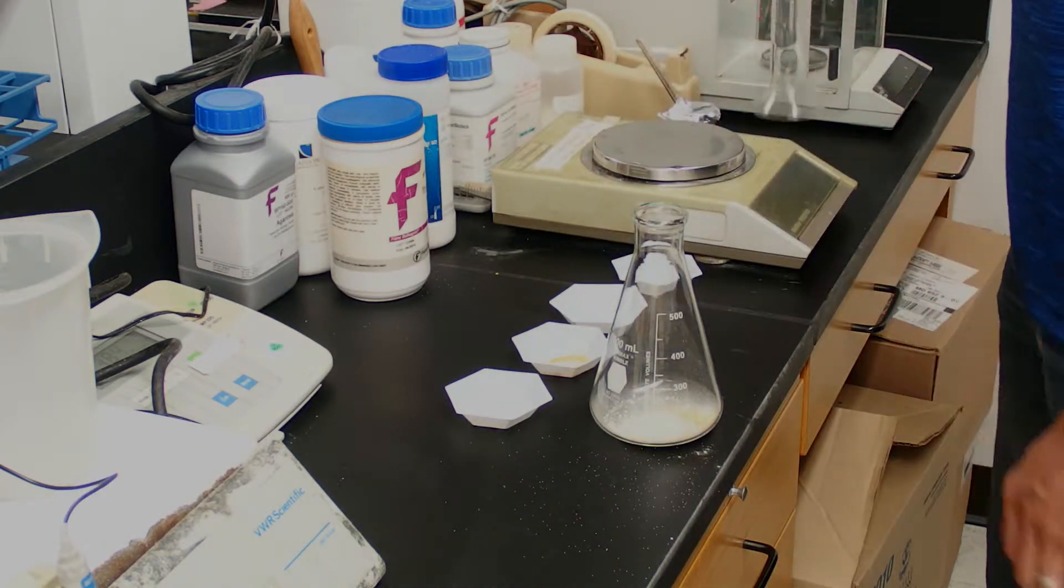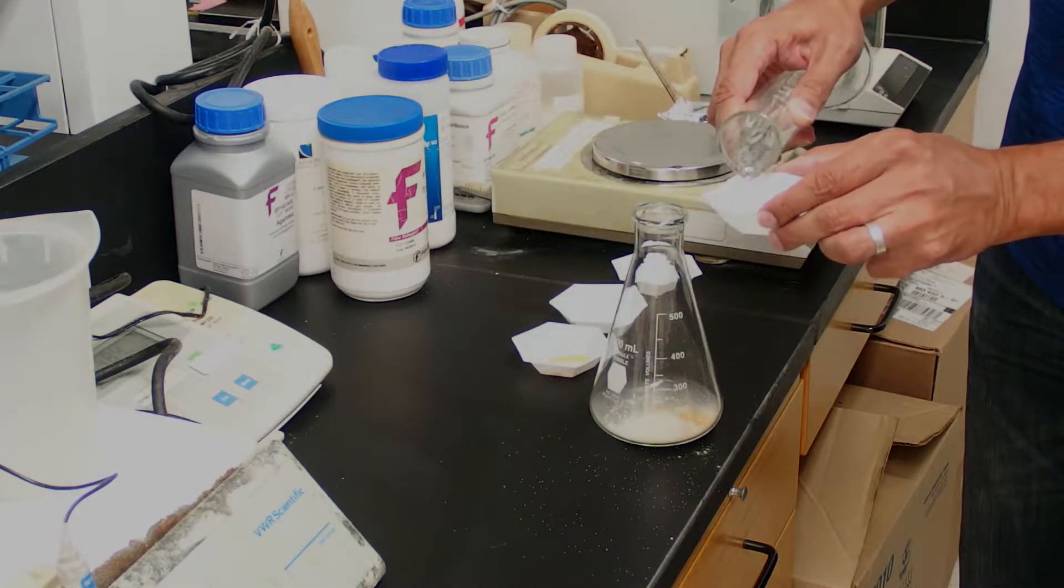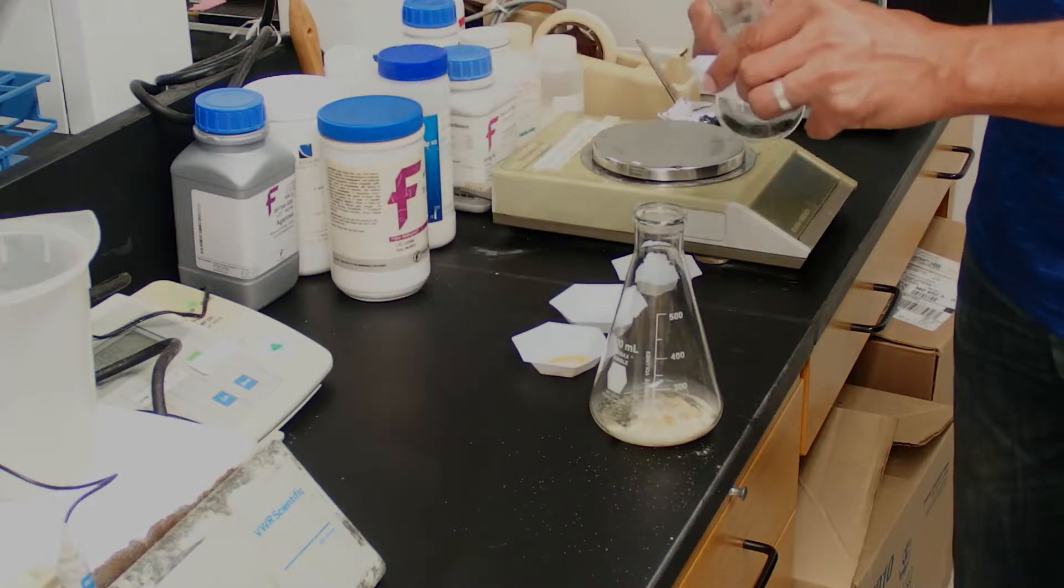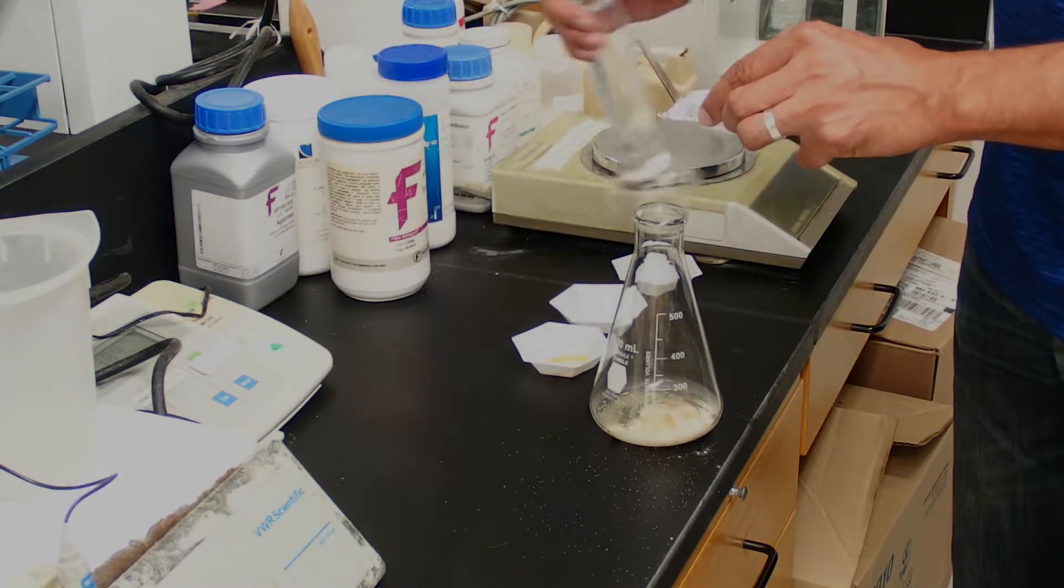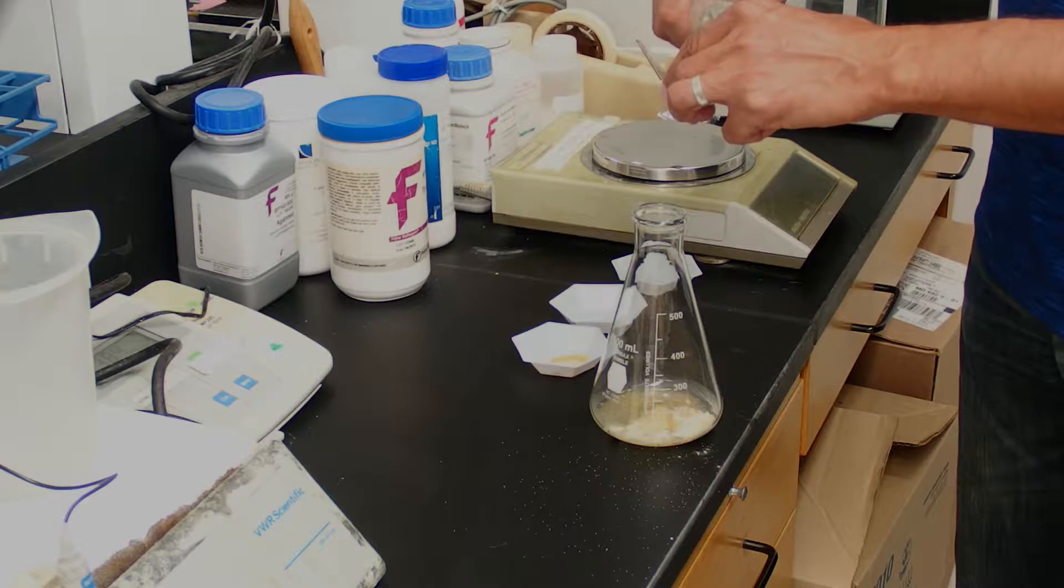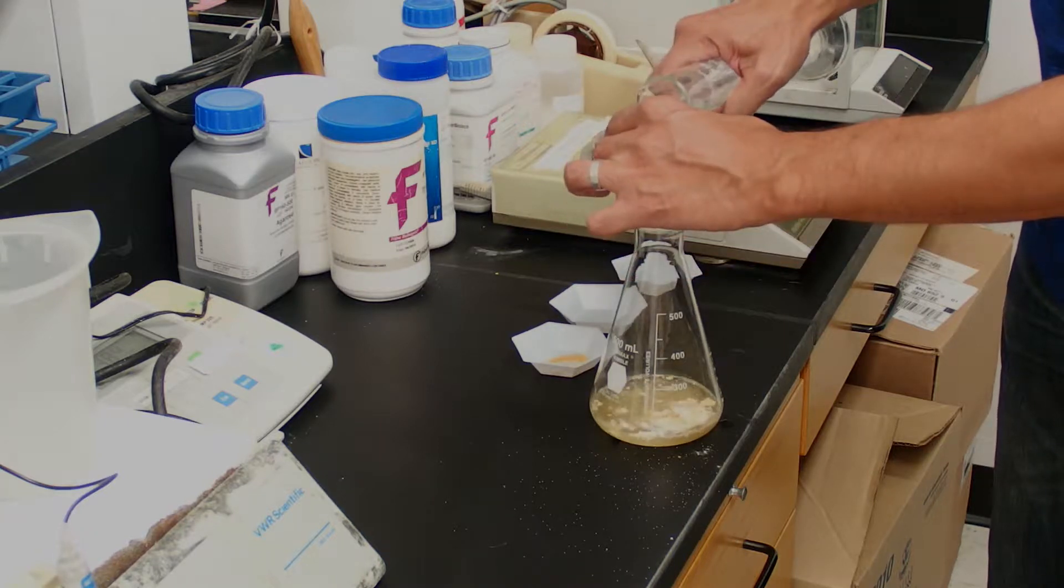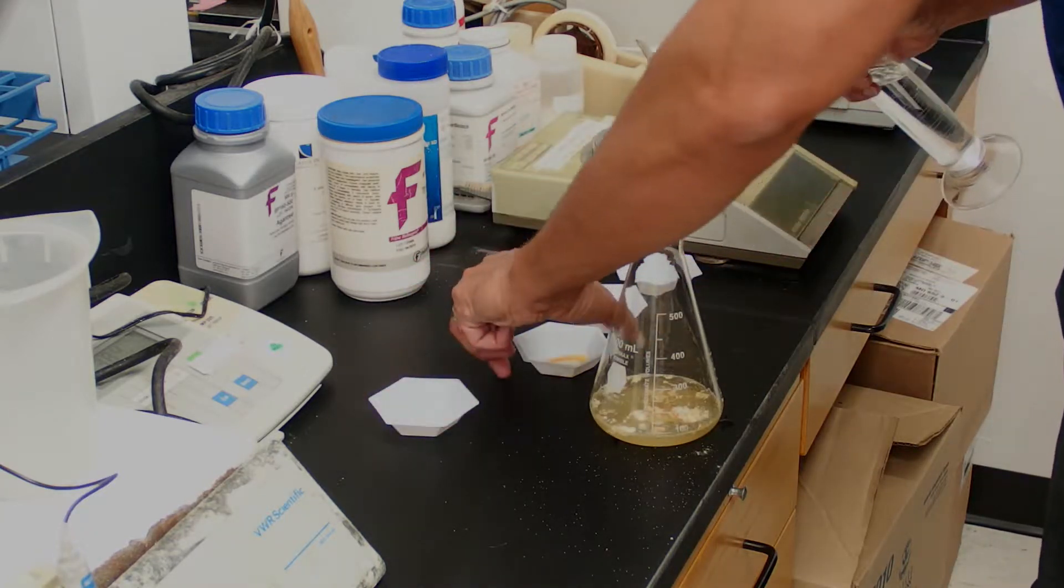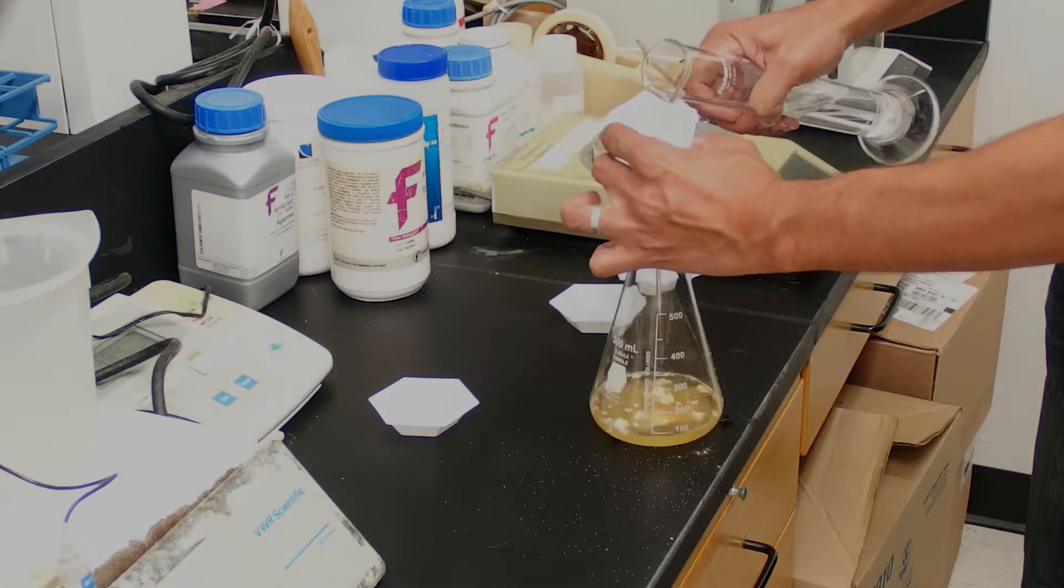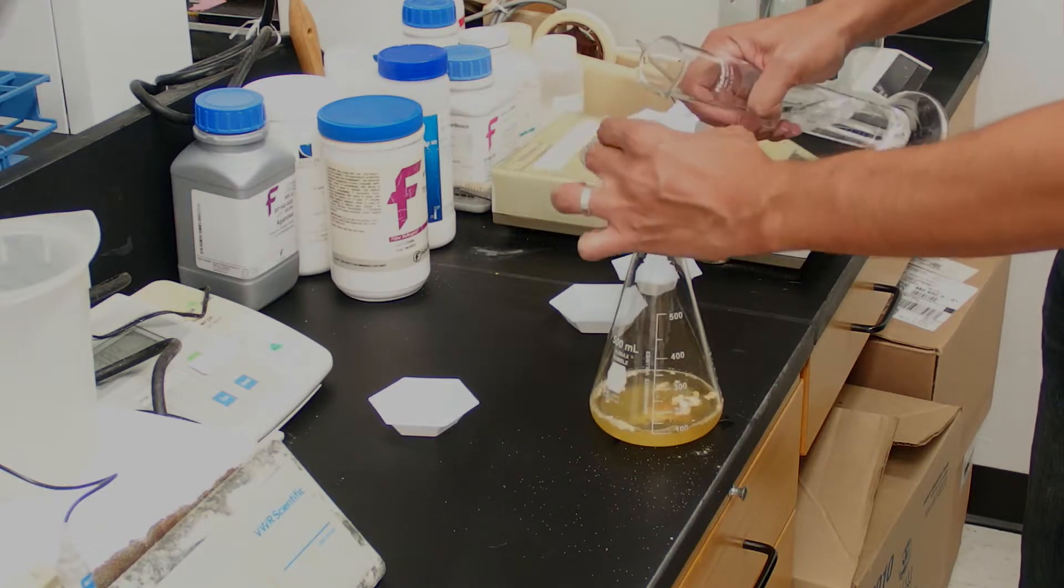I have 200 milliliters of ultra-pure water. I'm going to use to rinse these weighing boats out into the Erlenmeyer flask a few times. This way we get all of our media into the flask.